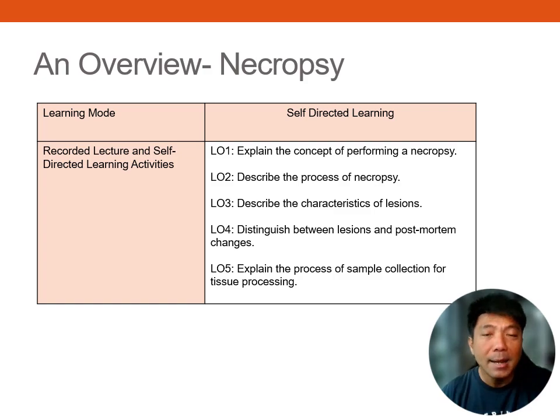Before we begin, let's review the learning objectives for this video. By the end of this session, you should be able to explain the concept of necropsy and its purpose, describe the step-by-step process involved in necropsy, identify and categorize lesions found during necropsy, distinguish between lesions and post-mortem changes, and lastly, explain how to properly collect tissue samples for further processing.